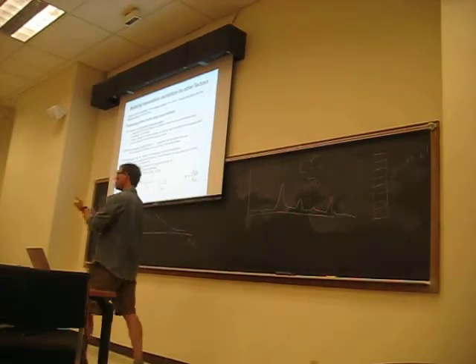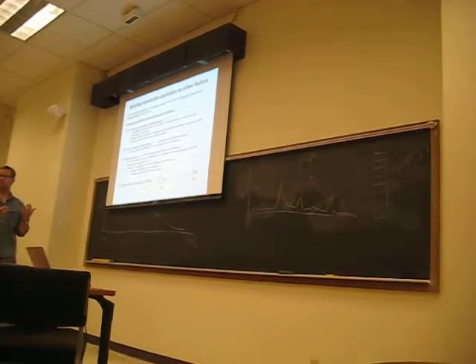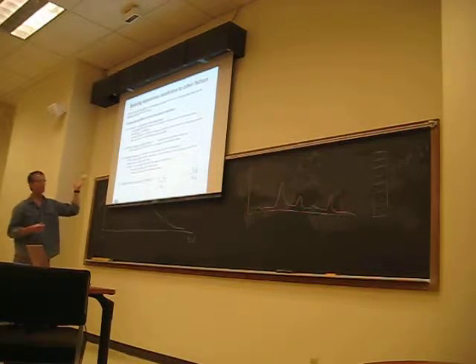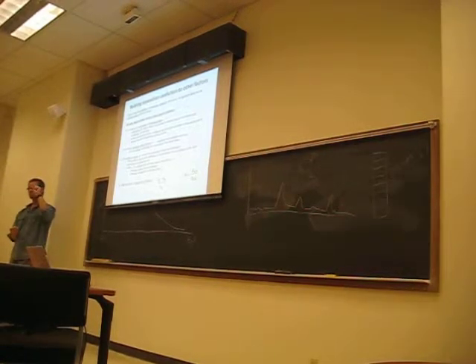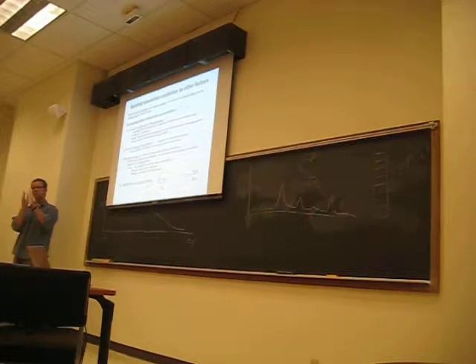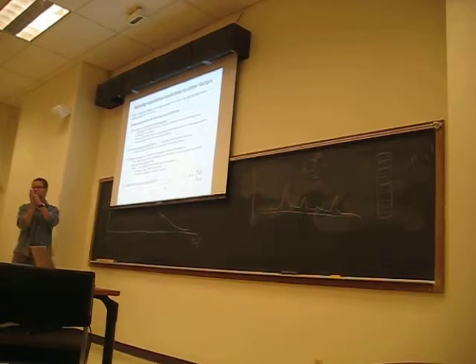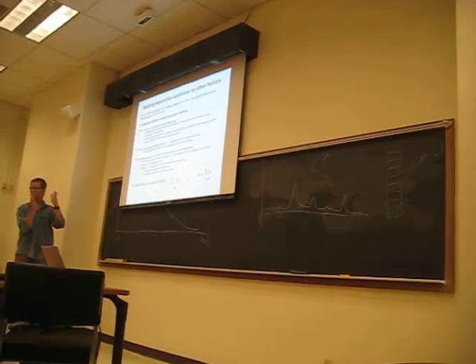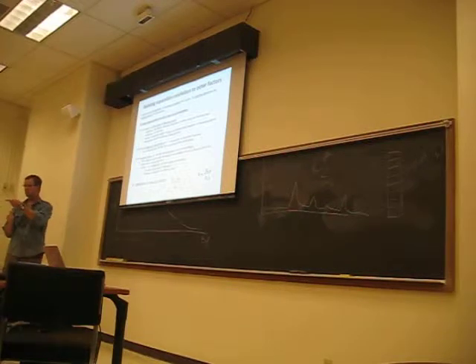So if we now have this goal, say in the real world, to maximize the resolution and performance of this chromatographic method, what things do I have in my control that I can change or optimize in order to achieve that? One of them is to minimize theoretical plate height, to make it smaller, which is going to provide more separation, more partitioning surface area upon which my analytes can partition, and ideally then lead to greater separation potential or resolution potential. That makes sense? And you don't look convinced.